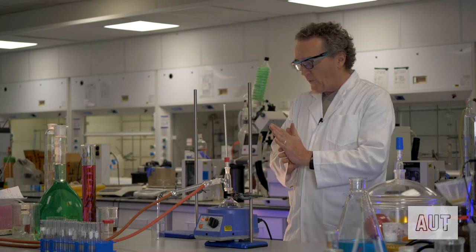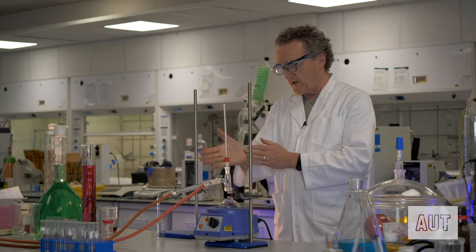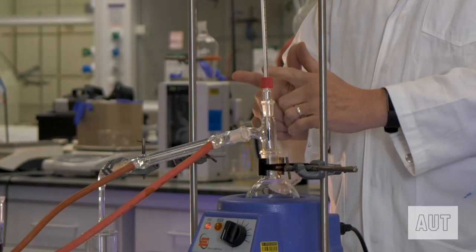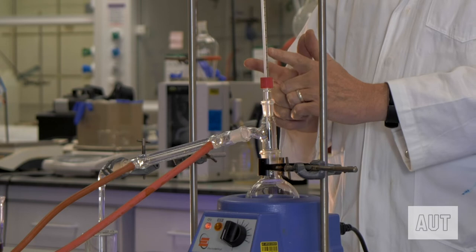Right, so we are pretty much all set to go. We have our water flowing through our condenser. All of the joints are tight. That's one thing to check and make sure.